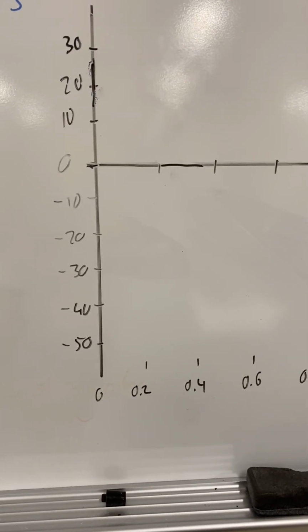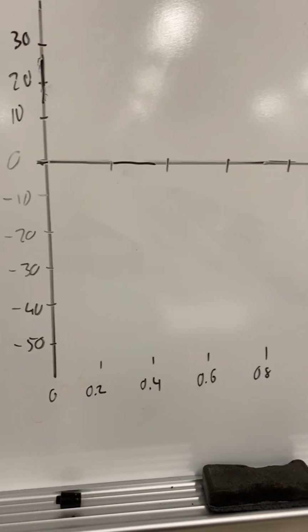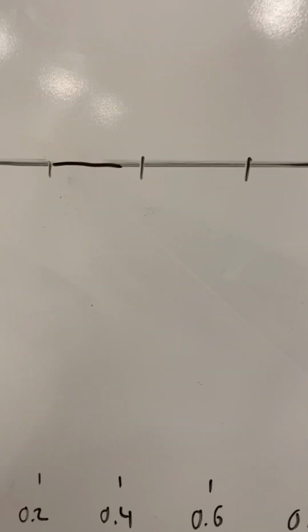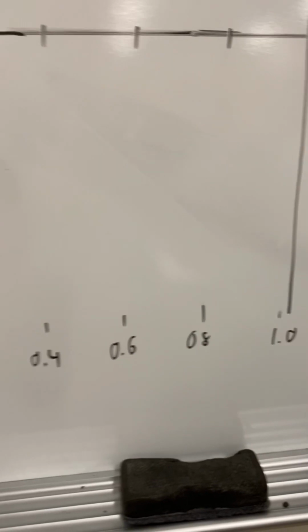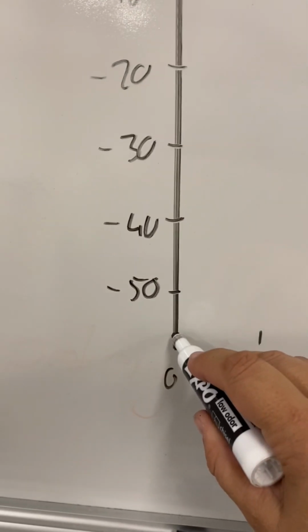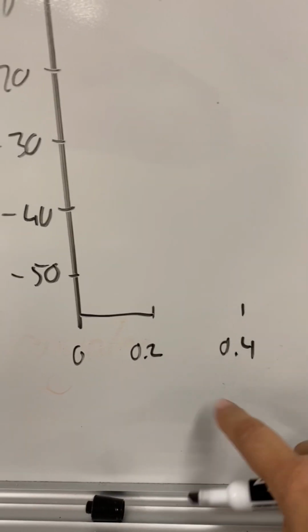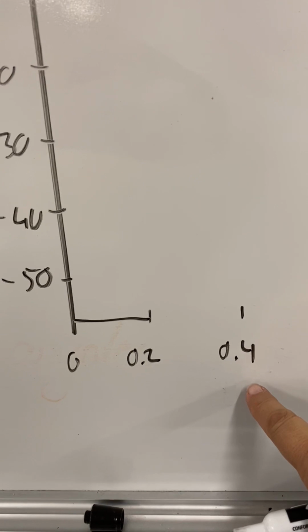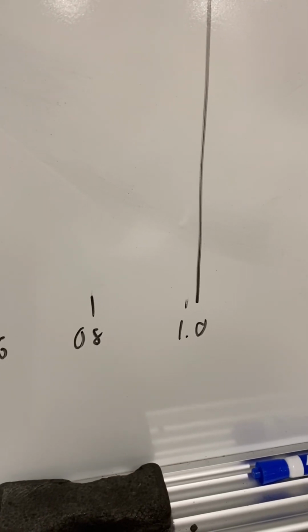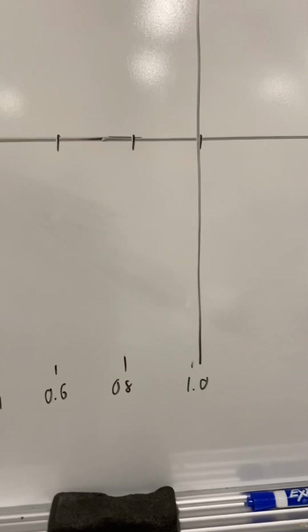It goes from 0 to 1, so 1 is our biggest number, and the 1 goes on the last line, so right here, and every 10 lines is 0.2, okay? So between here and here is 10 lines that are going vertical. Every 10 lines, 0.2, another 10 lines, 0.4, another 10 lines, 0.6, another 10 lines, 0.8, and then another 10 lines, and you're at the 1.0 molarity, and at the last line, that's on the x-axis.